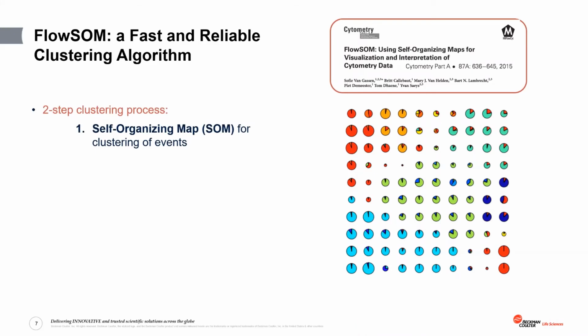Okay. All right. Would you explain how metaclusters can be annotated for certain cell types, such as T cells and NK cells? And Steph, can you answer this, please?